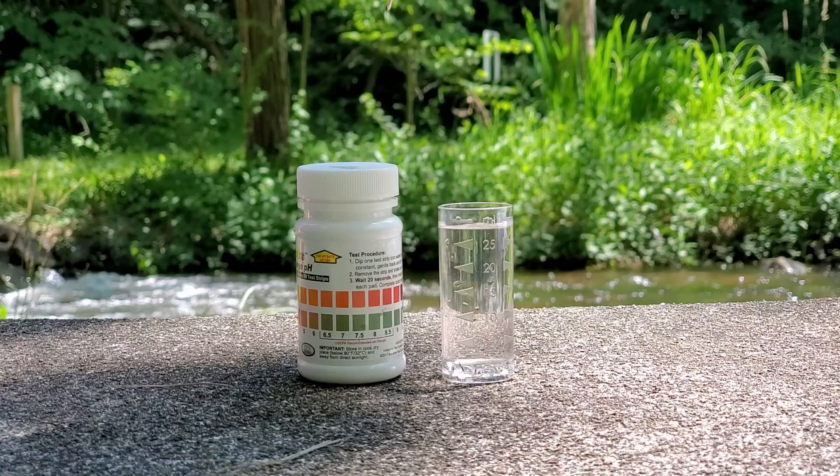Testing for pH has been made easy by using pre-made test strips, much like testing pool water. There are many brands of test strips, but in this case we will use Waterworks brand.